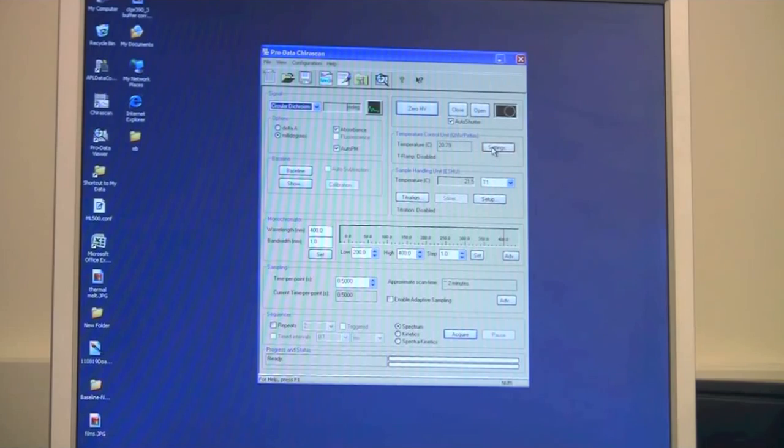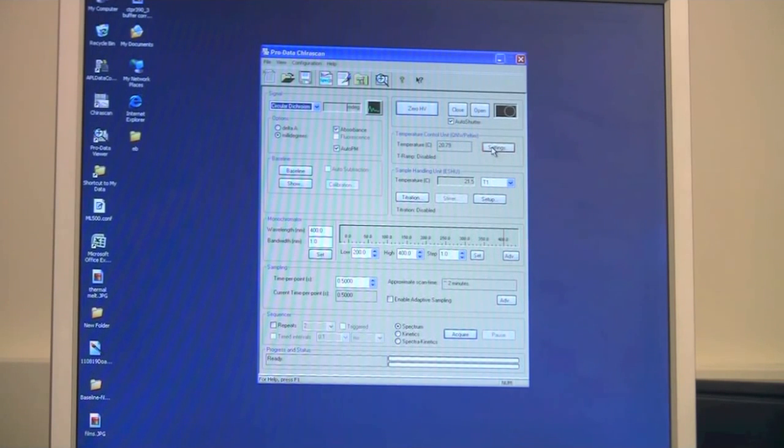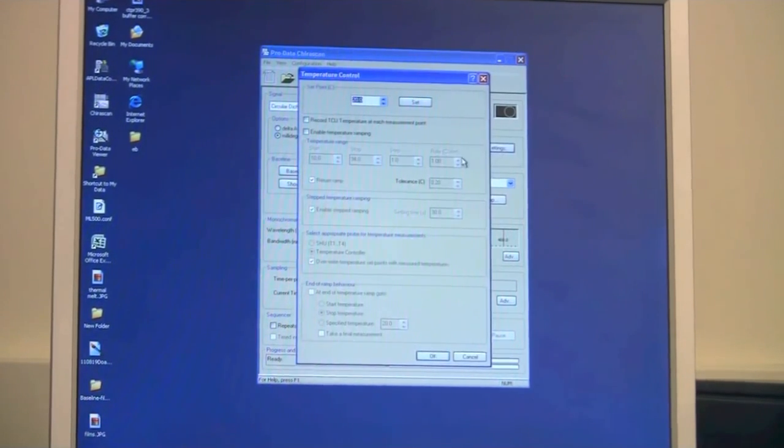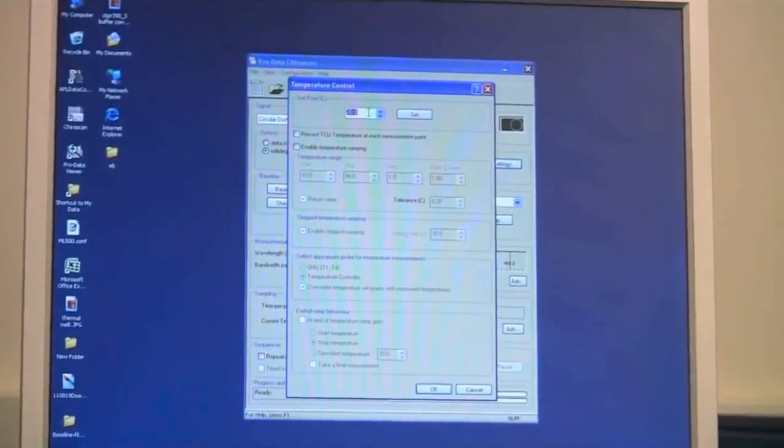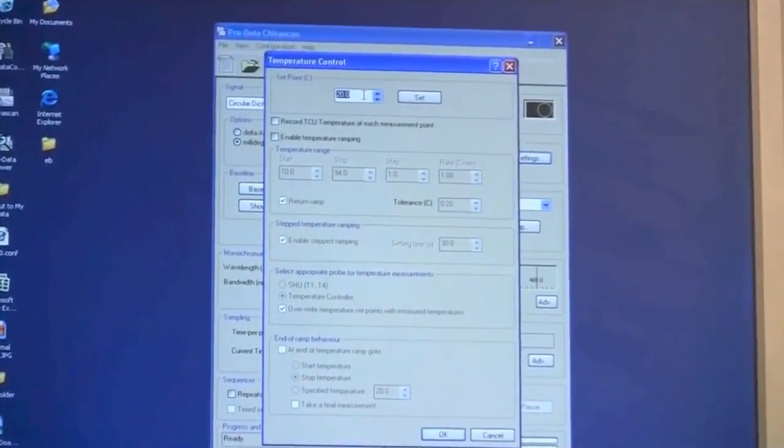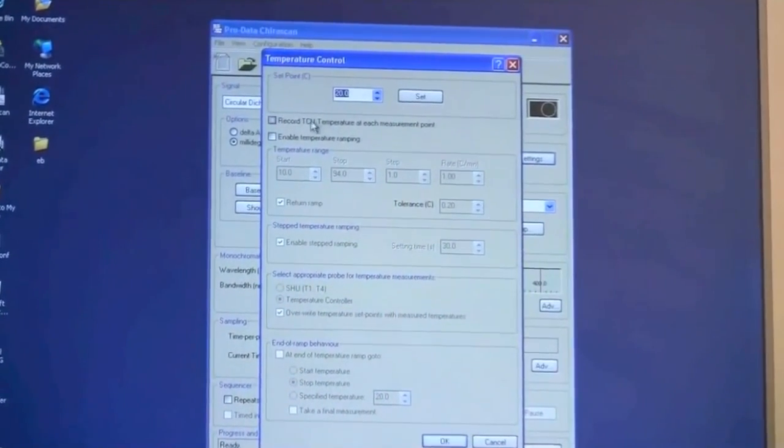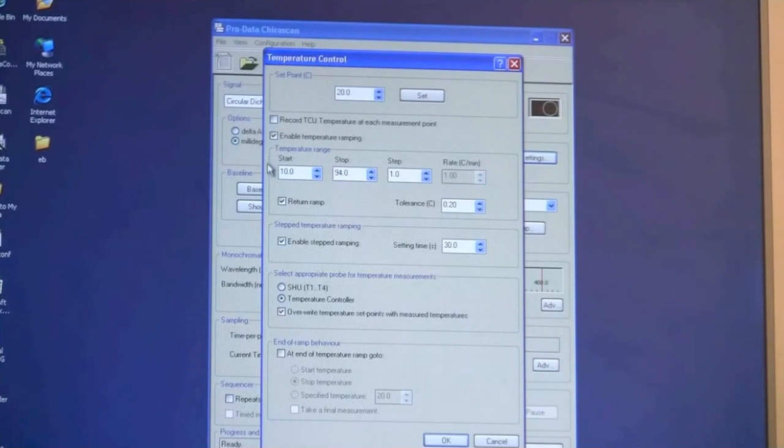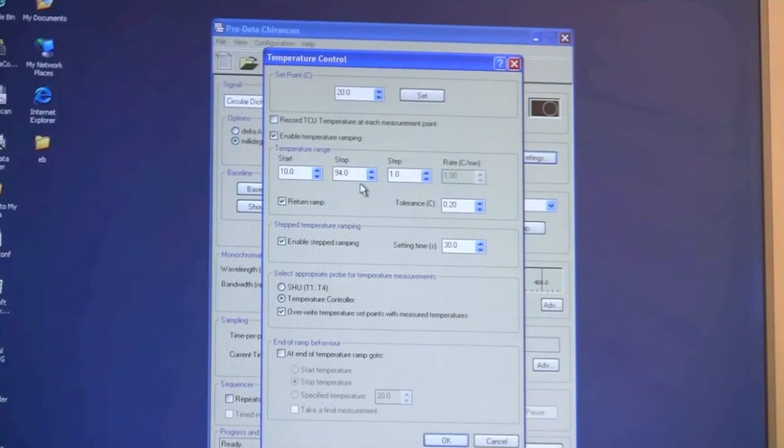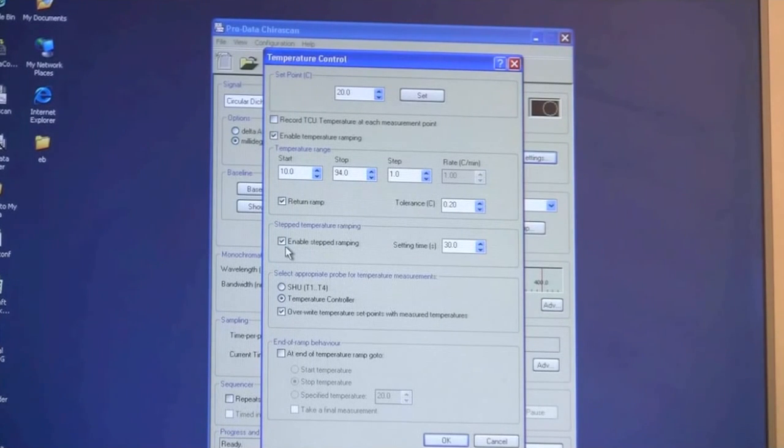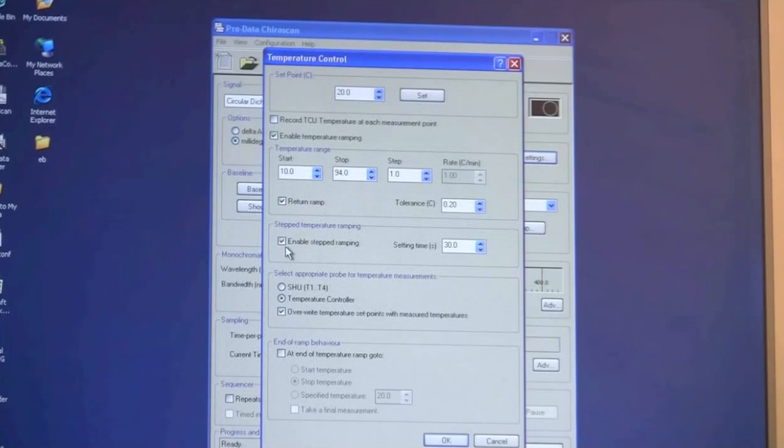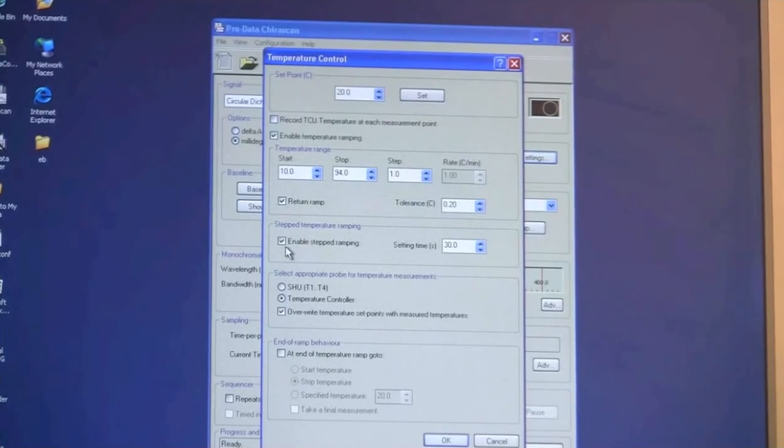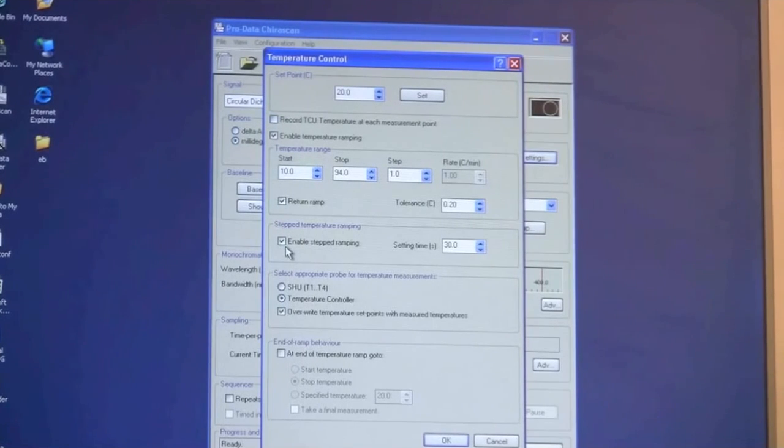You can set up temperature ramps. You have different options for that. So if I click the settings, you will have a window here. You can set one specific temperature if that's what you want. Or you can enable temperature ramping. And you have the option of setting a range of temperature you want to look at. You can either do it as a step ramp where you go to one specific temperature, settle there, do your scan and move to the next temperature. Or you can do a continuously ramp which is also explained in our manual and on our website.